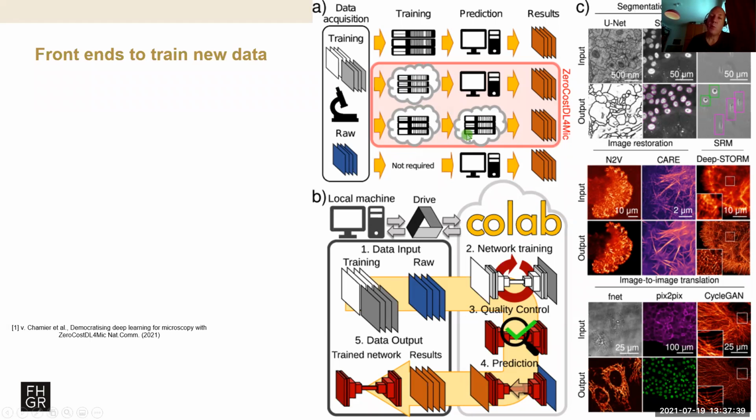Or otherwise you could use, of course, also computer hardware at your lab. The disadvantage there is that you can't simply run it on your laptop, because most laptops are not powerful enough. Potentially, if you have a gaming computer, such a gaming computer could be used for training deep learning networks. You can surely not use any of the single board computers like Raspberry Pi or the like. That's not possible.